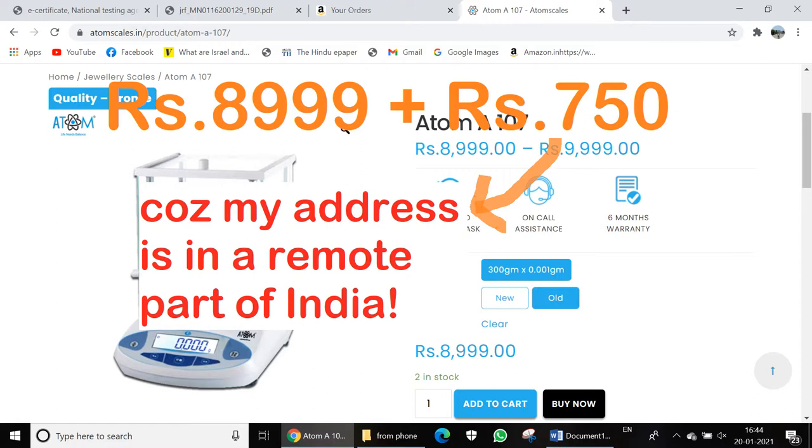This immediately raised a red flag, but my home lab was already in dire need of a budget electronic balance that's sensitive enough for most lab weighing operations. So I was left with no other choice but to negotiate with the seller and hope to somehow eliminate or at least bring down the extra shipping costs. This is the first time in my life I had to actually negotiate and bargain over an item sold on an e-commerce platform.